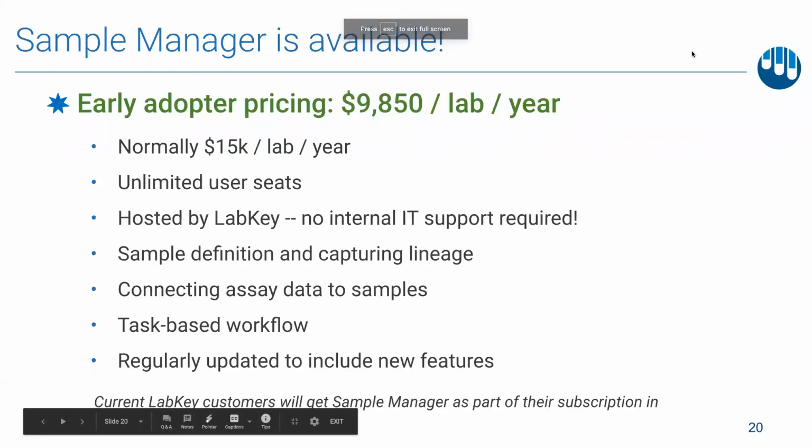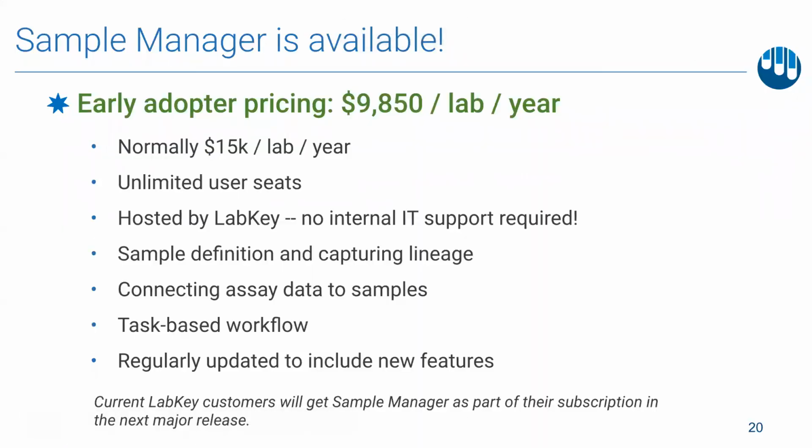So as you've seen, the three key components of LabKey Sample Manager have been built out to enable sample definition and capturing lineage, assay upload, and assigning samples to a workflow job.